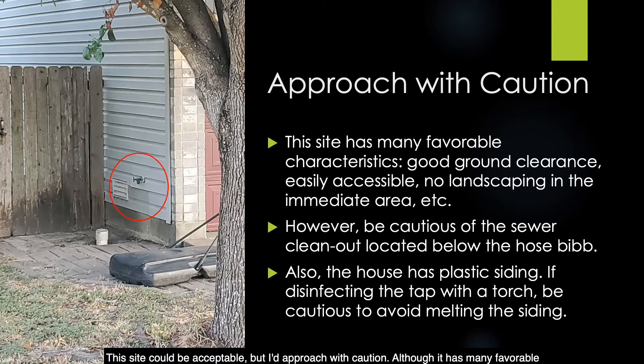This site could be acceptable, but I'd approach with caution. Although it has many favorable characteristics, be cautious because there is a sewer clean-out located directly below the hose bib. Also, the house has plastic siding — if you are disinfecting the tap with a torch, be cautious to avoid melting the siding.